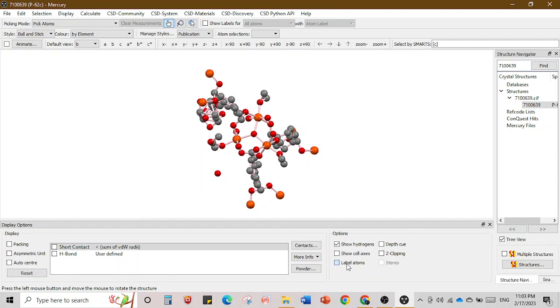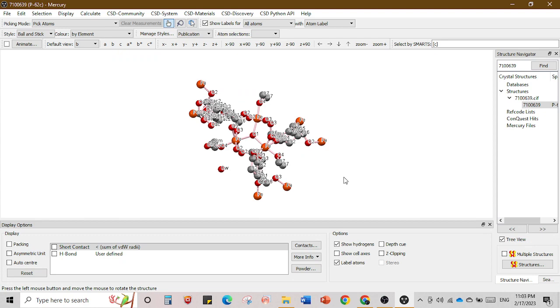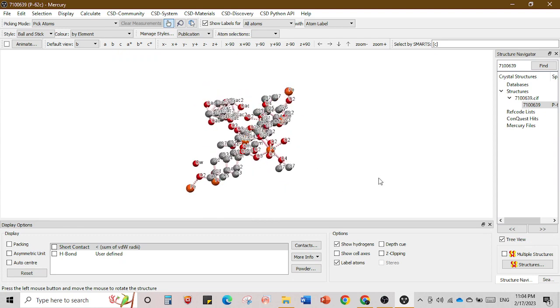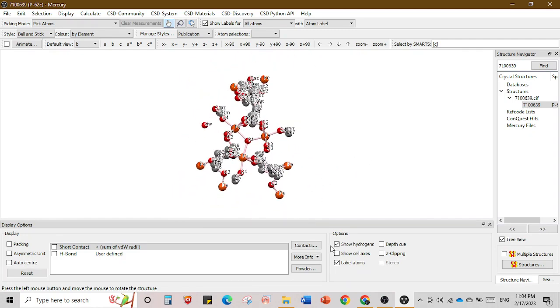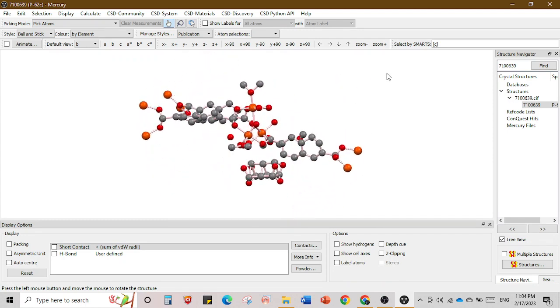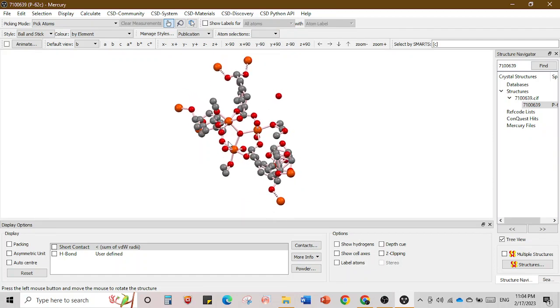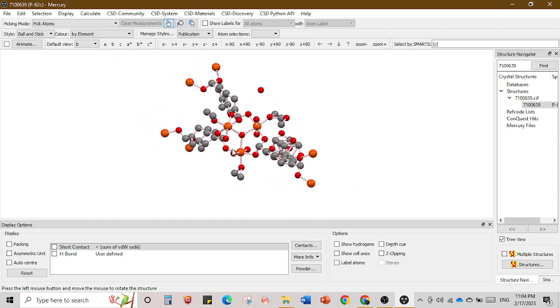To know which atoms are which, you can go here and click 'Label Atom' — it will label the atoms. The orange colors are iron and the red colors are oxygen, and then you have a gray color for carbon. These are the three types of atoms available. Now I'll click 'Remove Hydrogen' and remove atom labels, so we can see the structure more clearly.